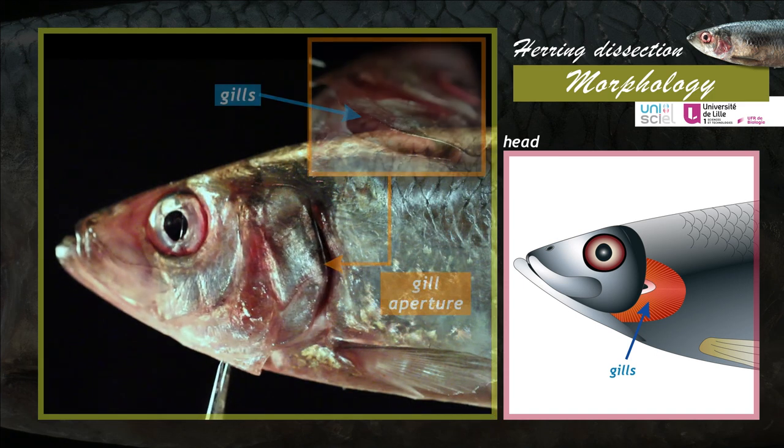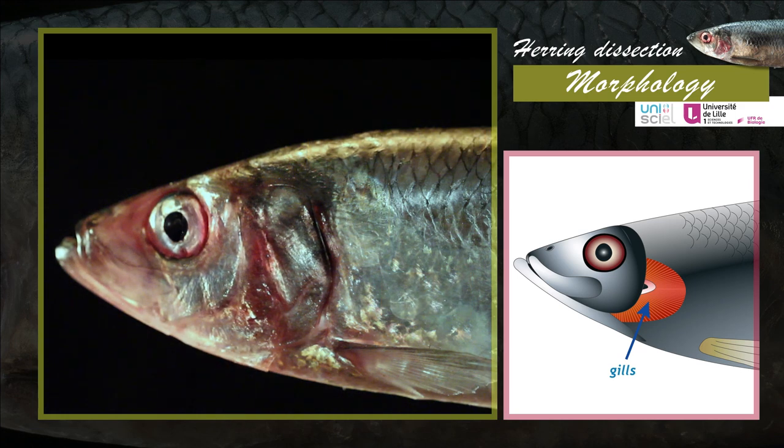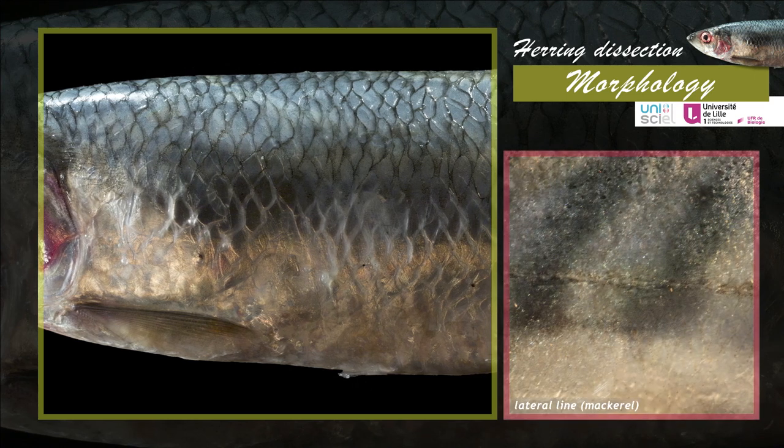During the breathing process, water comes out through the operculum slit, the gill aperture. The herring has no lateral line, a sensory organ present in most teleosts.